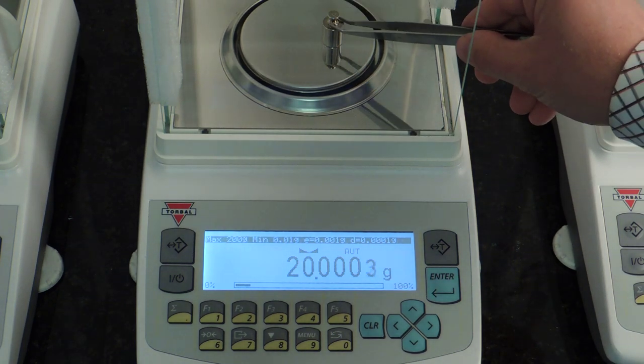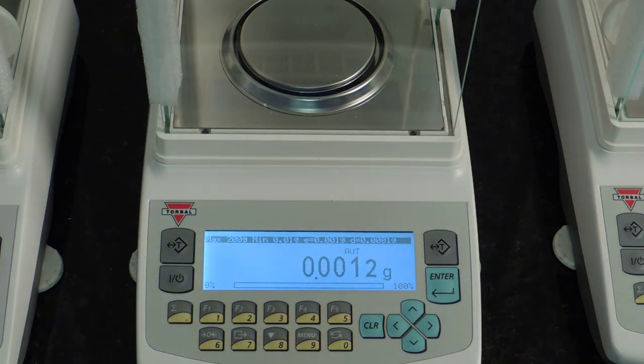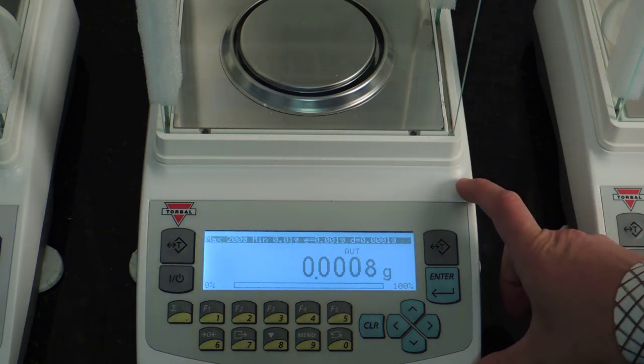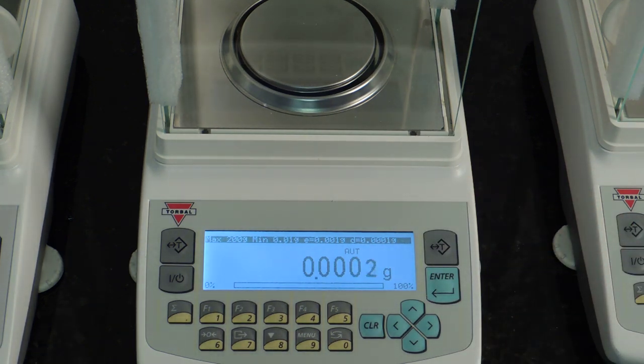The AGN is equipped with automatic internal calibration. There's a built-in mechanism inside of the scale that will calibrate the scale automatically at startup or preset time intervals. We'll go over some of these features later on in the video.